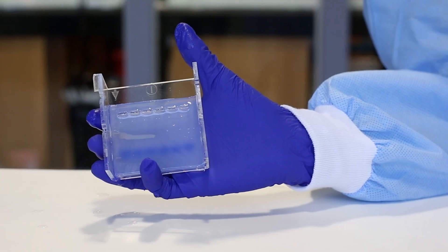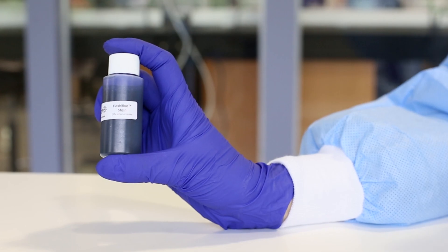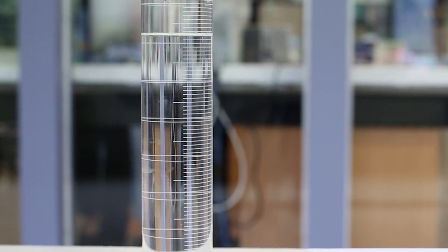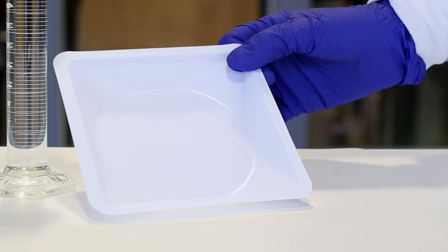For this experiment, you will need an agarose gel with DNA samples, 10x Flash Blue DNA Stain, distilled or deionized water, and a small tray or a wayboat.